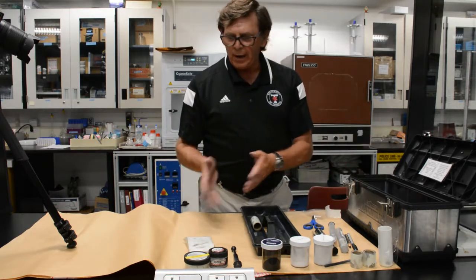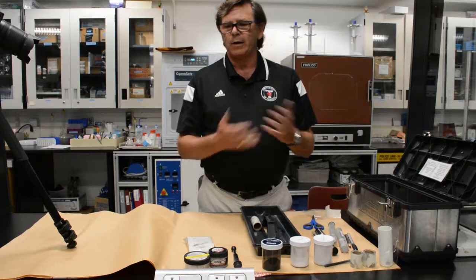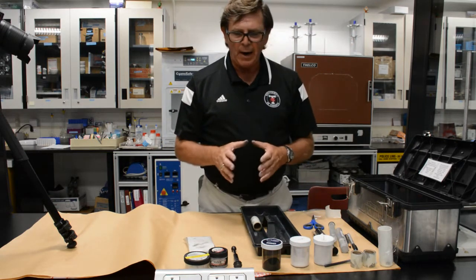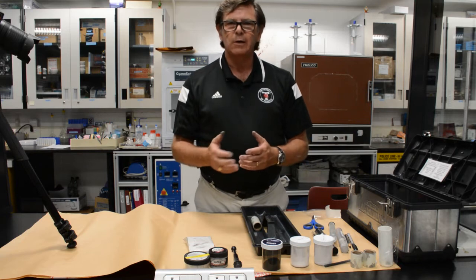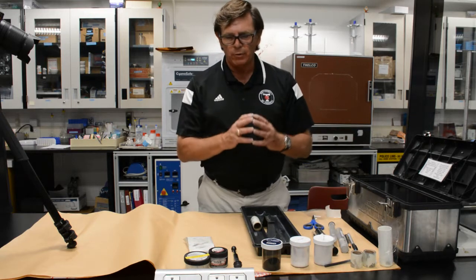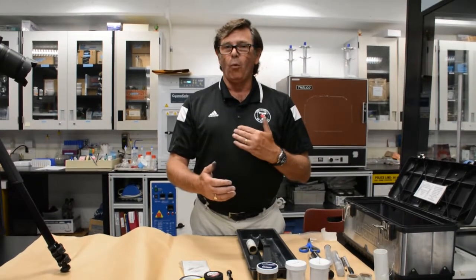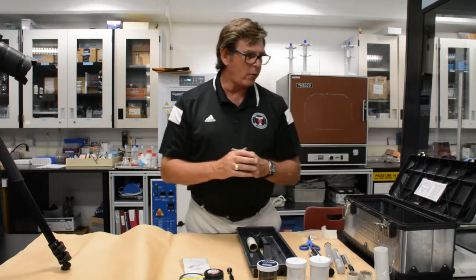So the ones that we have are black and white for sharp contrast. If you're using a gray fingerprint powder, it will give you contrast. It will work effectively on either the white or on the black card. That's more of a personal preference than anything else. There are certain powders, and I did touch on this before, additional powders that are not part of the kit. It could be fluorescing powders. They could be reverse Stokes powders, which again we'll talk about as we go through some of the other lectures. It could be bichromatic powders that are designed to work with either a dark or a light background. Because it's bichromatic, it will work in both lighter or darker conditions.